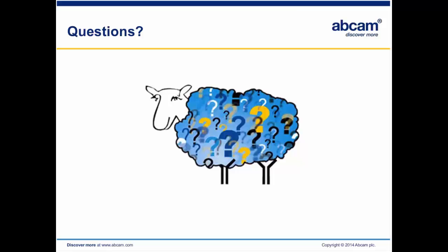If you use the method in this webinar, the number we normally get from transcription factor ChIP-seq is around 1,000 to several thousand. If the number of binding sites falls below 1,000, you need to put a question mark. However, you cannot simply judge whether the experiment works or not solely based on the number of binding sites. You also need to check other things like motif results and visual inspection of your signal intensity. Okay, so this is the last question, and thank you all for attending this webinar.